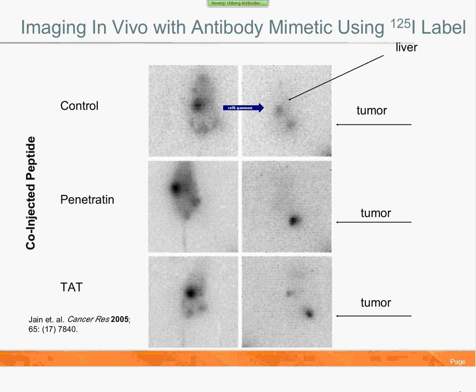A couple of cautionary statements, or things you need to make sure and do when you're conducting these experiments. While you can certainly add as many fluorophores as possible, this could significantly affect the distribution of your antibodies, and if the fluorophores start collecting near the active binding site of your antibody, it could actually affect its ability to bind to the target. Do purify your antibody away from unconjugated fluorophore prior to injection into the mouse.